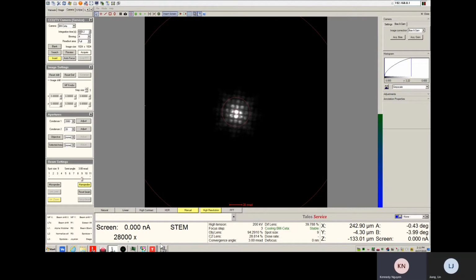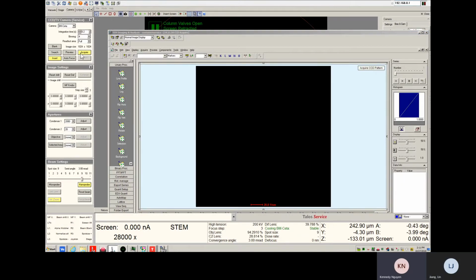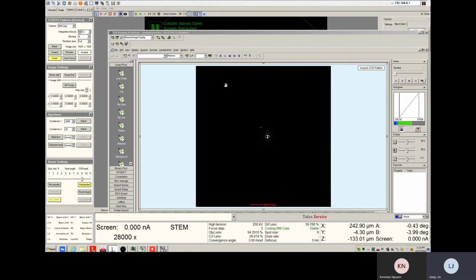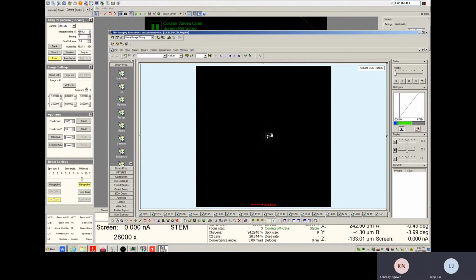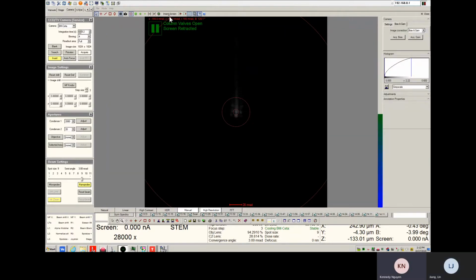Okay, let me go over to Tia. Oh, different. Okay, I'll take the picture again. I forgot to do that as well. And it's pretty small, because we use very small cameras, right? Oh yeah, we need to increase the camera. Yeah, okay. On the screen again.